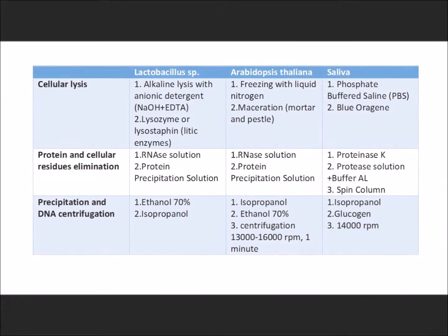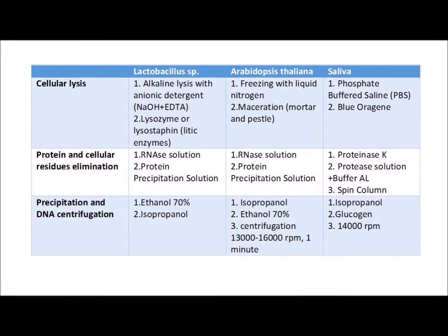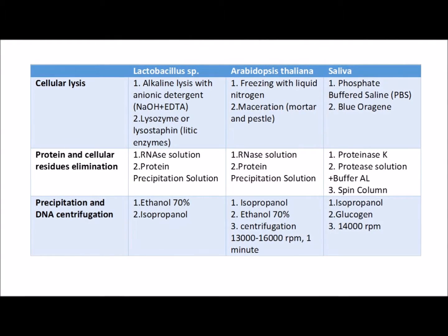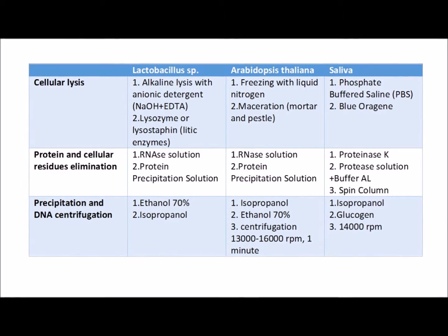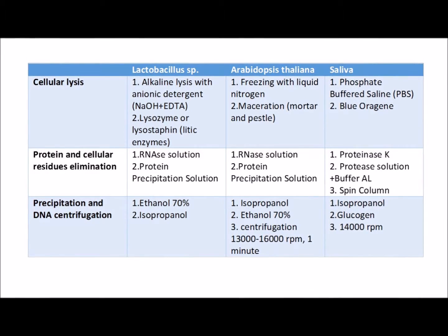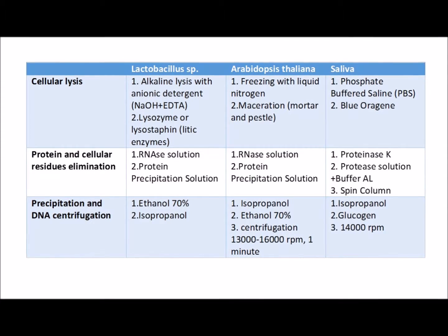There are different protocols according to the type of microorganism or cell from which DNA is going to be extracted. The main differences are observed in the cellular lysis step. For Lactobacillus, a gram-positive bacteria, lytic enzymes should be added in order to disrupt the multilayer membrane cell wall.